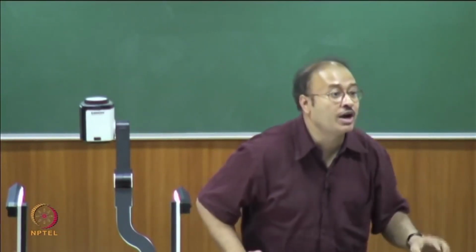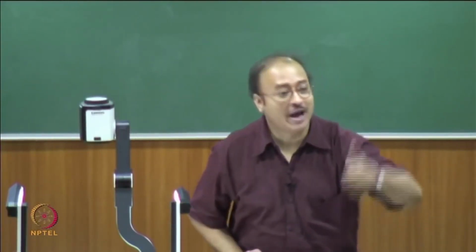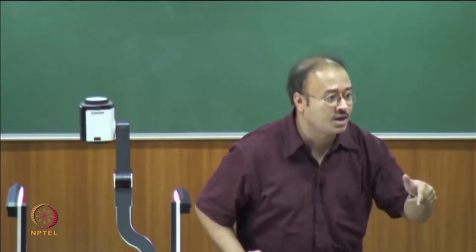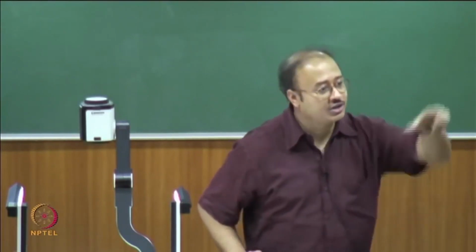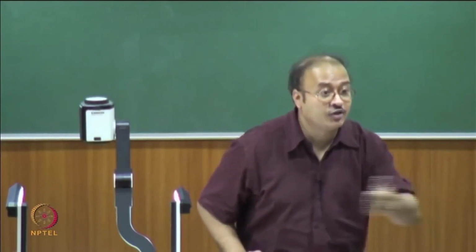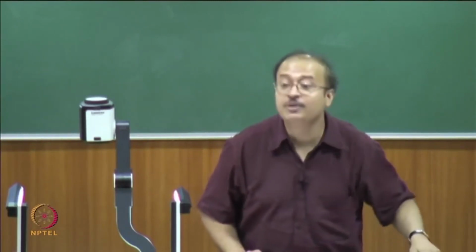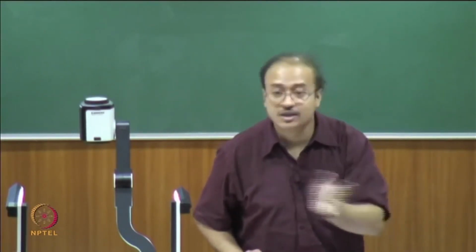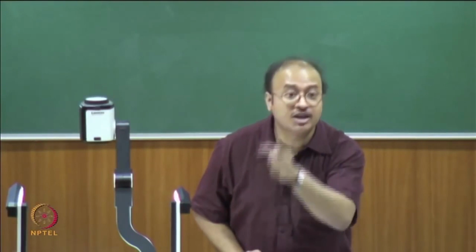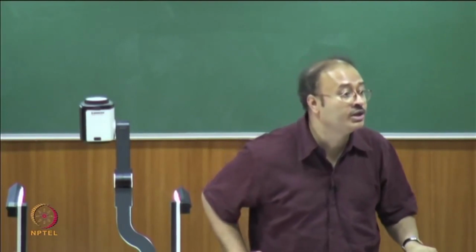But the problem is, remember, where are you probing the protein? At 1630. H2O has a huge absorption band at that place. Then whatever change you have in the protein would be masked by that absorption of H2O. But the moment you do an isotopic substitution, remember, your vibrational frequency depends upon 1 by 2 pi root over k by mu, and keeping the force constant the same, because mu is changing, there will be a shift in the vibrational frequency. So, you move the masking band out of the way and just look at the protein itself. That is the function of D2O, that is why you do it in D2O.